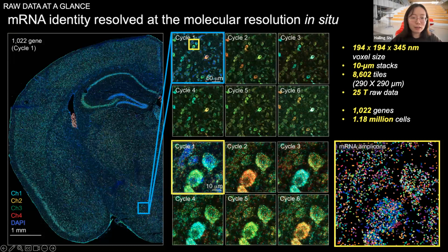Yeah, that's a really good question. We do have the capacity to extend to more genes by adding one more coding base in the identifier. In the RiboMap study I talked about at the end of the presentation, we have a probe gene panel for over 5,000 genes that we compiled from single cell RNA sequencing data of different mouse organs. So it is definitely doable to map more genes.